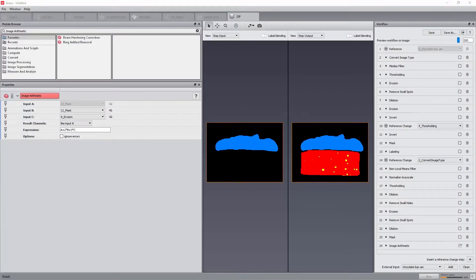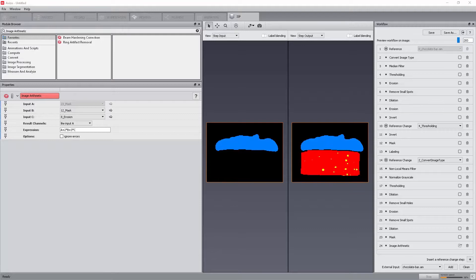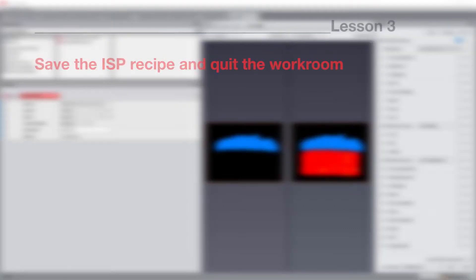In the previous lessons, we have created a workflow to segment the three phases of the chocolate bar, namely the pores, nougat, and caramel. At this stage, it is a good idea to save the workflow being edited.